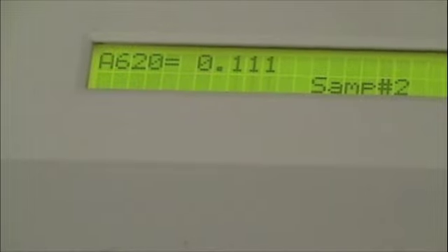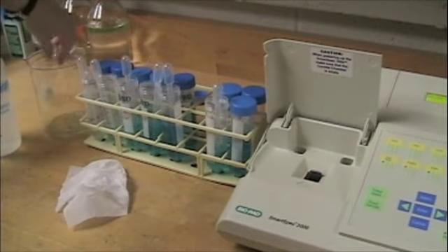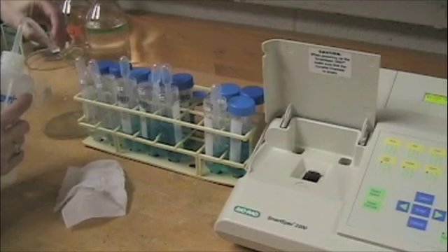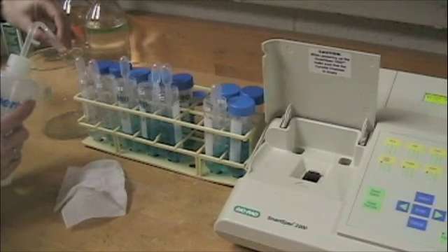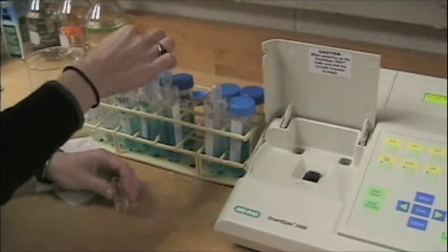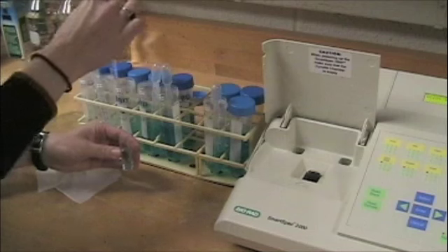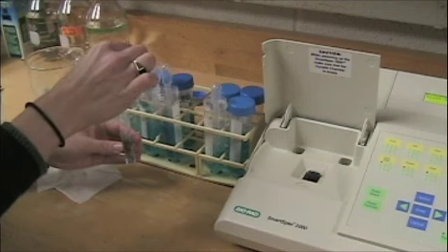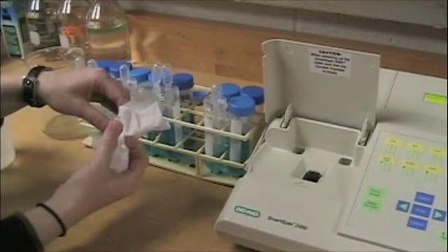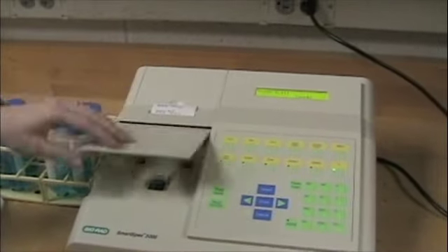Okay, moving on. Sample number 3. Take out my cuvette, dump it in the waste, rinse it out with some DI water just to make sure I don't cross-contaminate. Ready for sample number 3. Fill my cuvette using the plastic pipette, wipe off any fingerprints, place it into the cuvette holder, close the door, and press read sample.